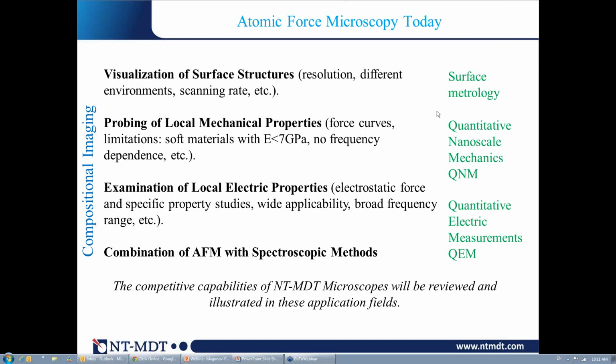Therefore, we look at atomic force microscopy from a different aspect, because we want to make it as quantitative a tool as possible. But there are challenges, and we need to find proper solutions to make this happen.